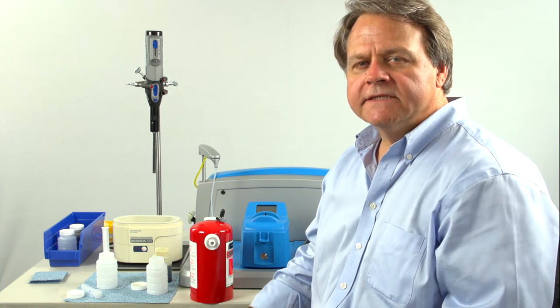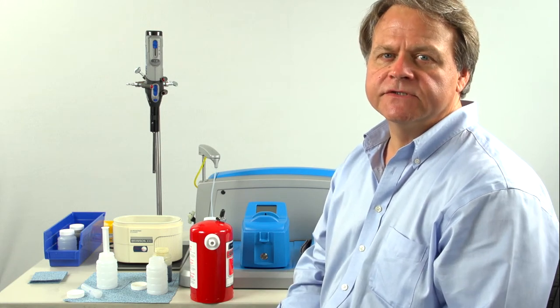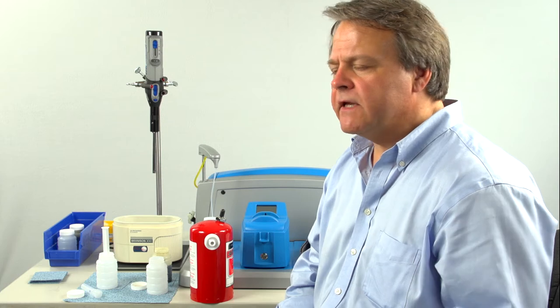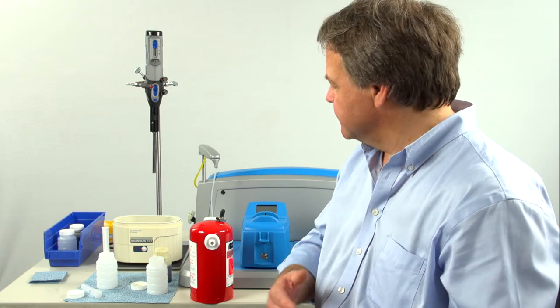The LNF can process undiluted oil samples up to 320 centistokes viscosity. If heavier oils are processed, they must be diluted. If dilution is used, it's very important to filter the solvent used for dilution, otherwise it can contribute errors to the particle count itself. There are many commercially available ways of filtering solvent.